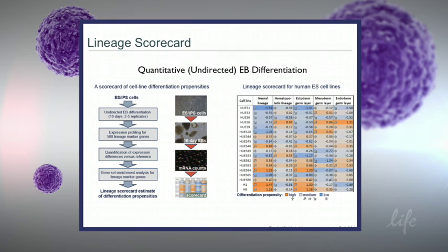But we wanted to do a little bit better, and so the idea was to see whether we can pick up gene expression signatures in immediately differentiated cells, when they form initial EBs. The idea was to find a quantitative signature in this early EB differentiation. Initially we had set up a panel of 500 plus genes. We profiled these and came up with signatures and scores.